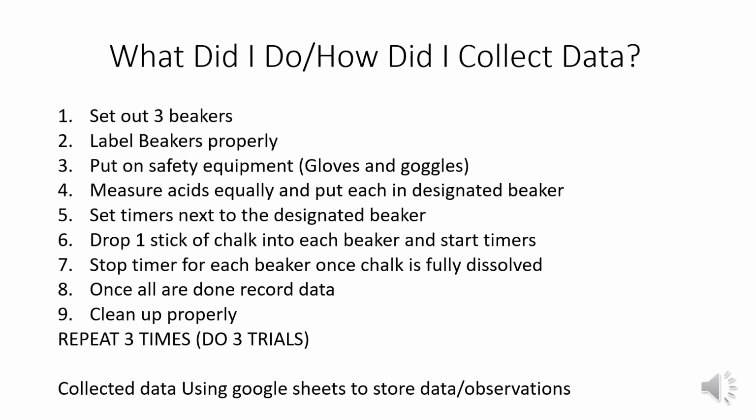6. Drop 1 stick of chalk into each beaker and start the timers. 7. Stop the timer for each beaker once the chalk is fully dissolved. 8. Once all are done, record data. 9. Clean up properly. I repeated this 3 times. I collected my data using Google Sheets to store my data and observations.